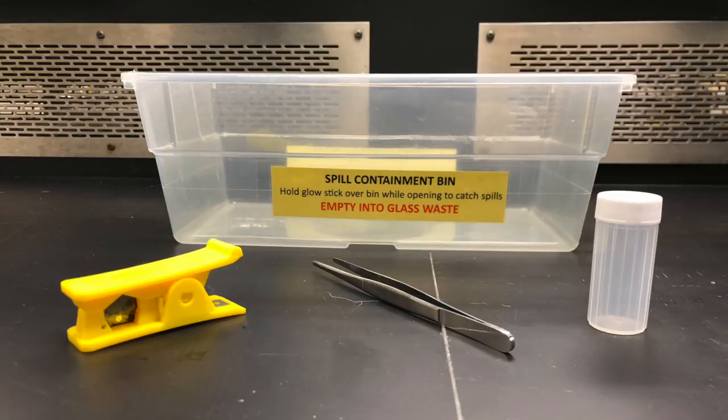For this next part, you will need a glow stick, tubing cutters, forceps, a spill containment bin, and a 20 milliliter plastic vial.